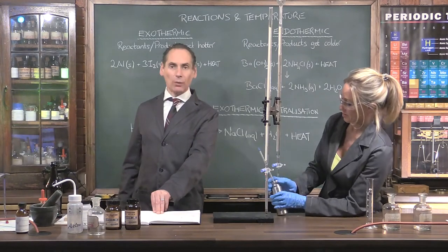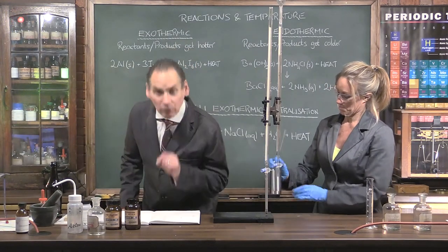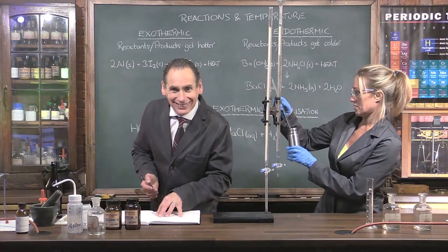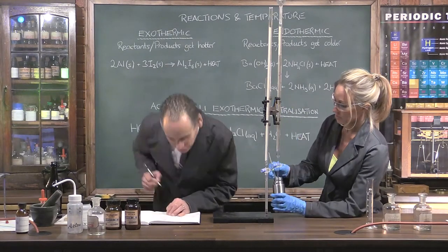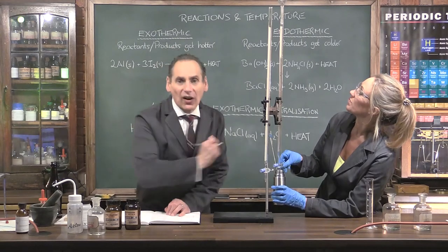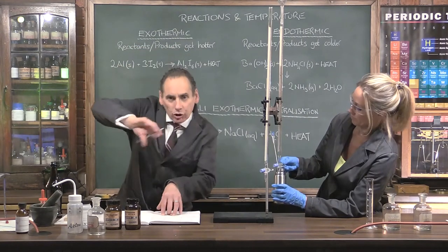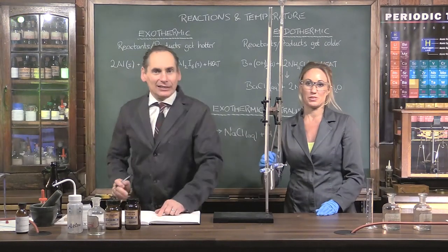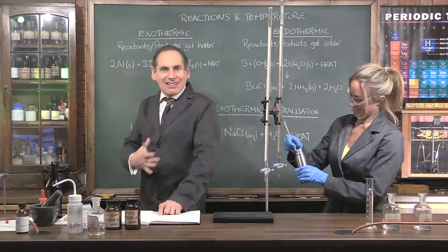Right, let's see where we are after a total of 10 millilitres. I'm poised. 26, that's good. Right, and another 5 going in, and a quick swirl, and then a measure. It's very energetic, all of this. It is, isn't it? Push. Right.